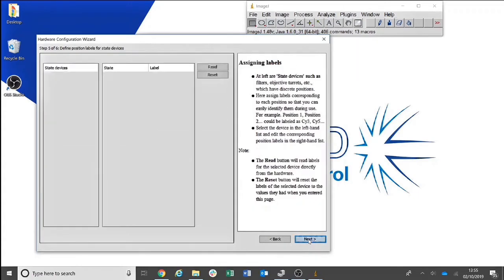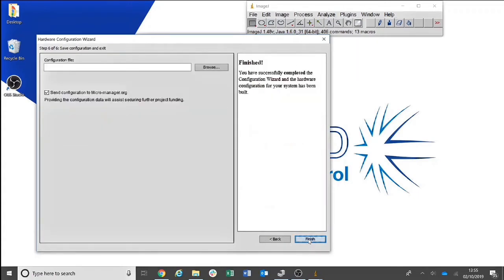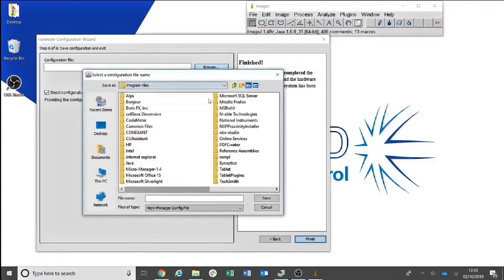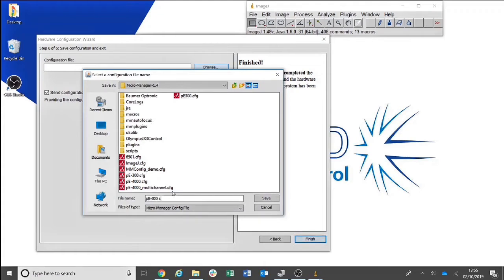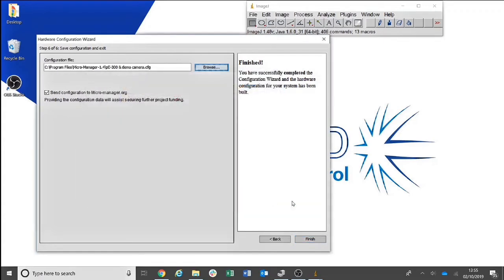Keep clicking Next until you reach Step 6. Here you can save the configuration file. Click Browse and ensure that you are saving the file under MicroManager. You can then give the configuration file an appropriate name, for instance, PE300 and demo camera. Then click Finish.